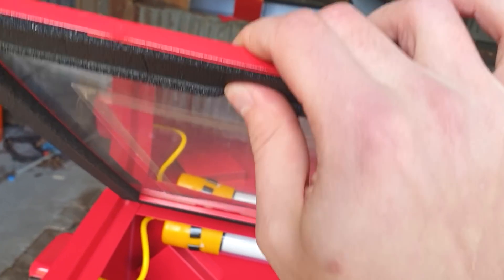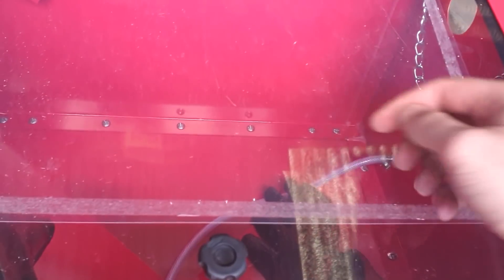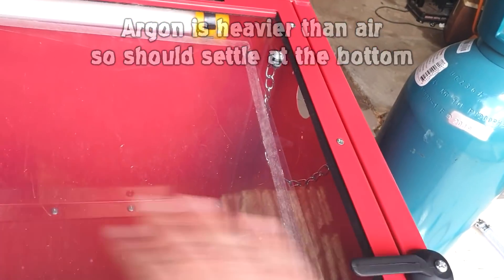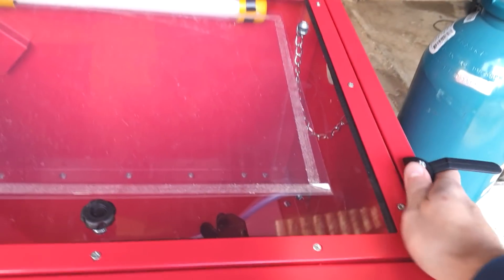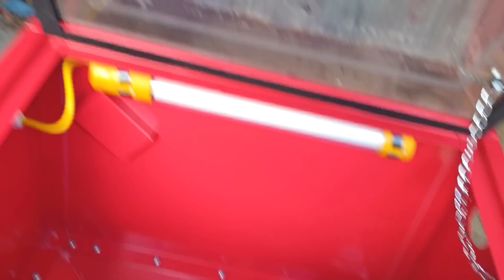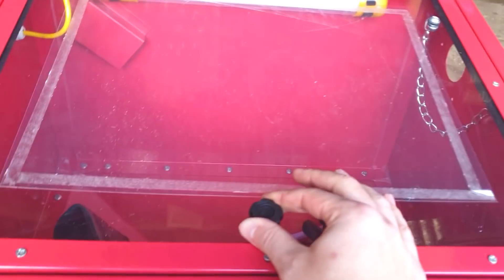We've also got to talk about this lid. It has some expanding foam and then you turn these clamps and it clamps it down. It's not too bad, and it's right at the top, so our argon filters down to the bottom where we'll be doing our chemistry. Even if we have some leaks up here, the argon is going out the top. We'd just maintain a constant flow of argon to keep it nice and inert down the bottom. One thing it doesn't really allow is nice sample changeover — if we want to get the box down to a good argon atmosphere and then realise we need a pair of tongs, we have to open this lid and ruin the whole atmosphere. There's no airlock.